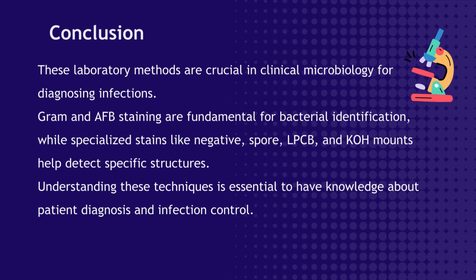Gram and AFB staining are fundamental for bacterial identification, while specialized stains like negative, spore, LPCB, and KOH mounts help detect specific structures. Understanding these techniques is essential to have knowledge about patient diagnosis and infection control.